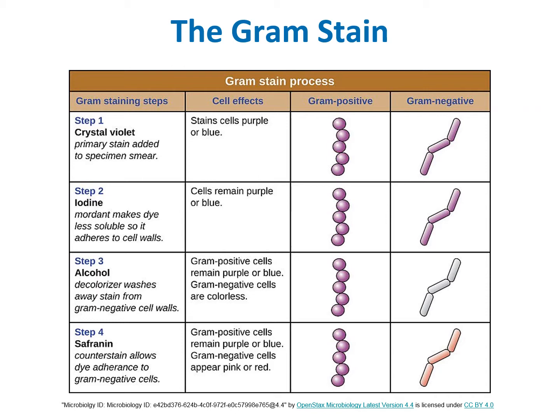So these are the chemicals that we use. The first one is called Gram's crystal violet. And this chemical is going to penetrate the cell wall, and it'll go into the cytoplasm where it stains components in the cytoplasm as well as in the cell wall. Because this is a violet colored stain and it penetrates so well, all cells, no matter whether they're gram-positive or gram-negative, stain purple.